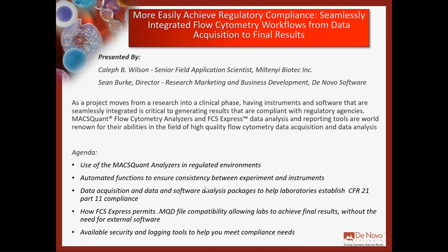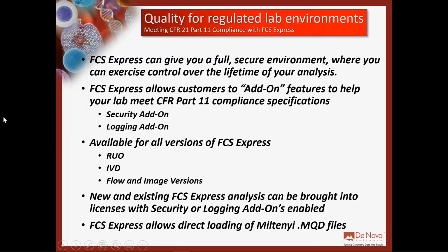And we're going to come in here for about the next 15, 20 minutes and talk a little bit about FCS Express and how FCS Express deals with 21 CFR Part 11 compliance. And we'll even jump right into the software itself. Now, before we do, I'll give you a little bit of background of quality for regulated lab environments with FCS Express.